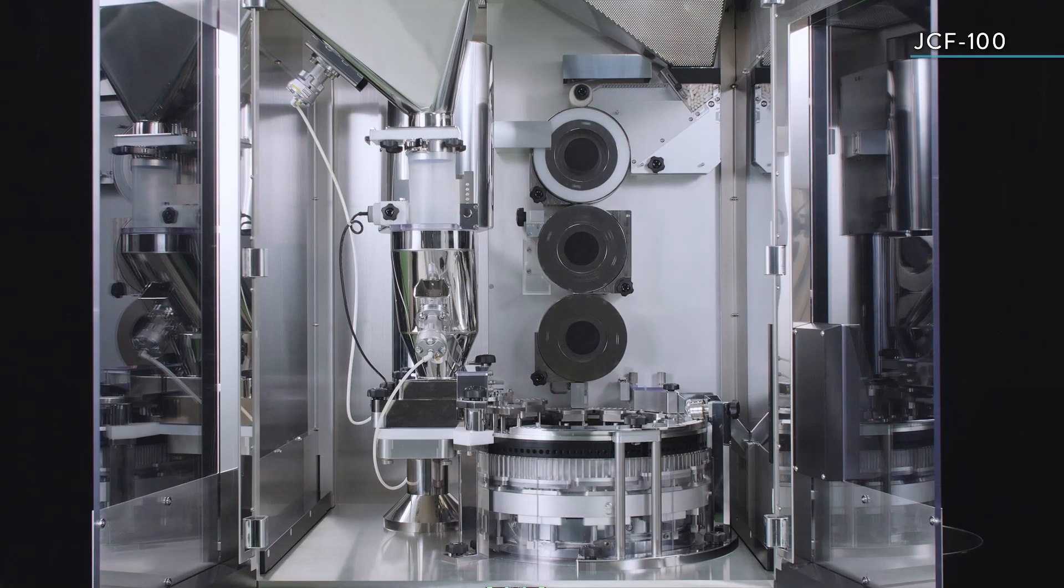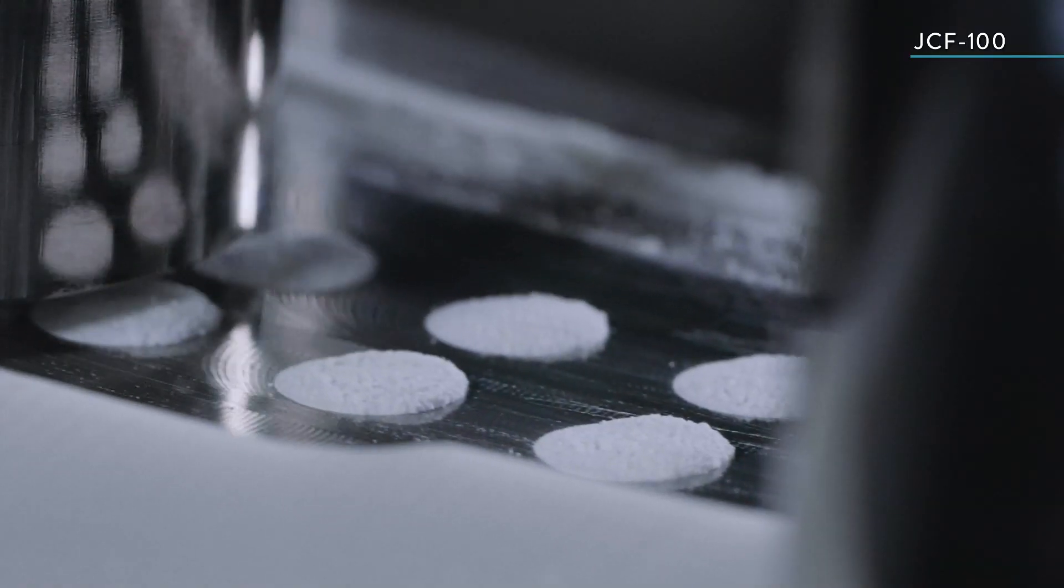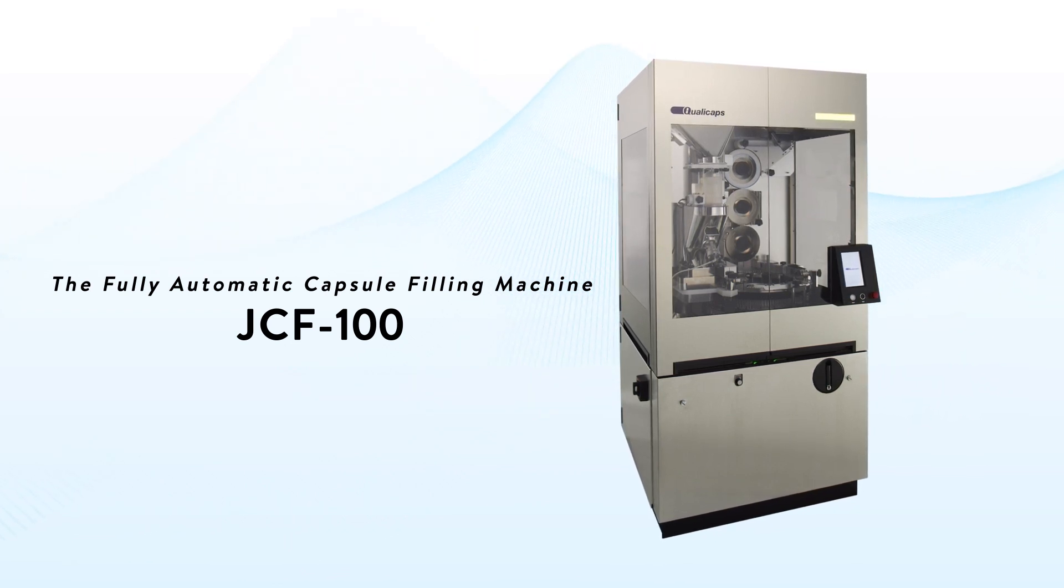For improved processing capacity and operability, the JCF-100, a fully automatic auger capsule filling machine, will be a powerful tool for a wide variety of powders.